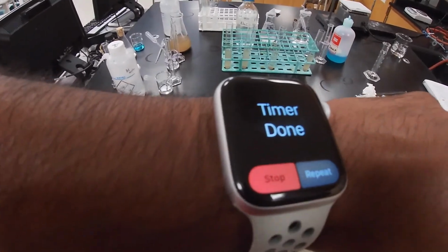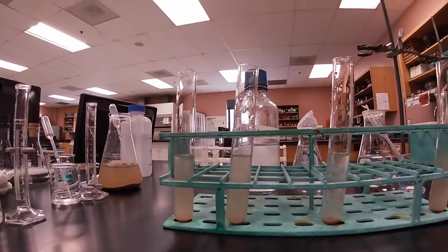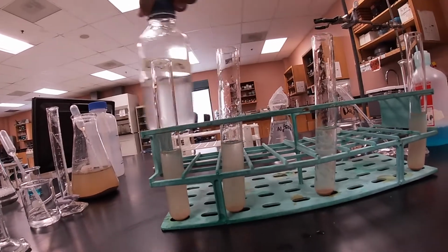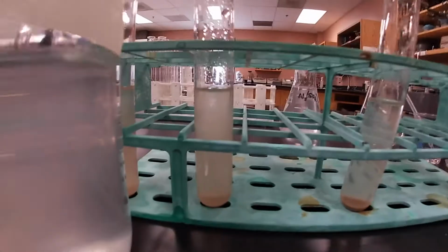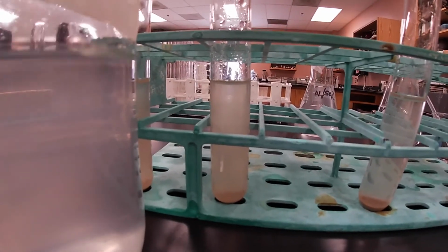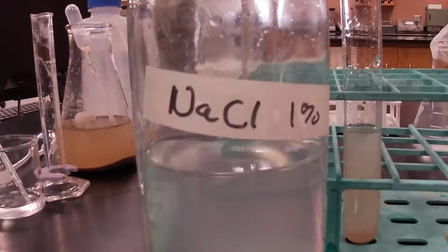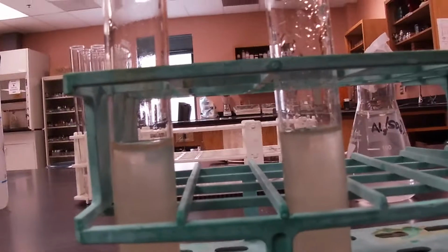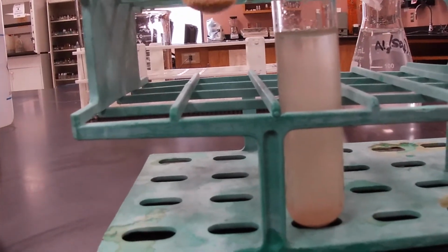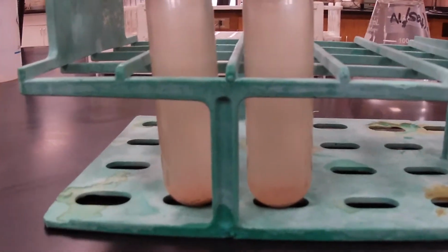So as you can see, the timer's up. The first 15 minutes are up, and let's check our solutions. The sodium chloride solution is gonna be the second one. So I'm just gonna stand it up straight. Let's get a little zoom in. So that'll be the sodium chloride solution. As you can see, it's still a little cloudy. So let's stand it right next to our sample. Okay, so they look kind of similar.